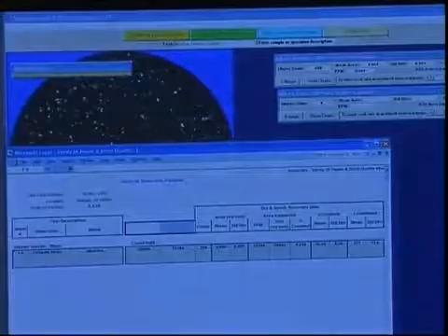Yes, the stickies are reported, and it's busily calculating the fiber. And now it's going to do the hairy stickies.